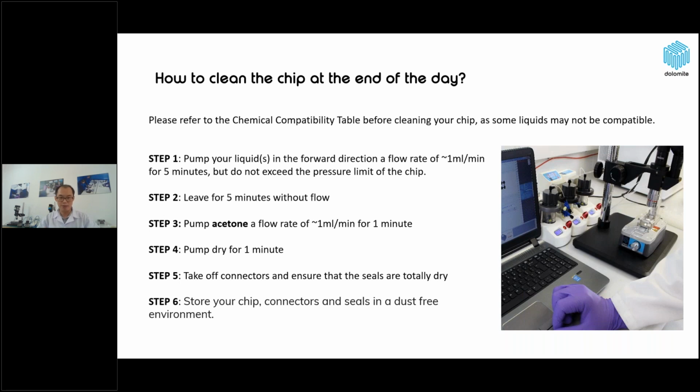And step 4, you pump dry for 1 minute. This step will remove all of the remaining acetone that you used in step 3 out of your chip. For this step you should use only air or an inert gas.